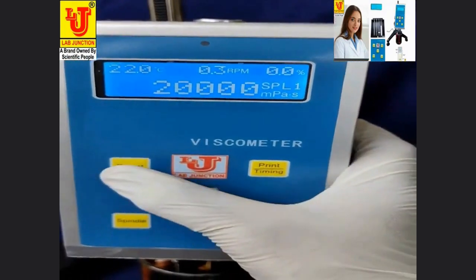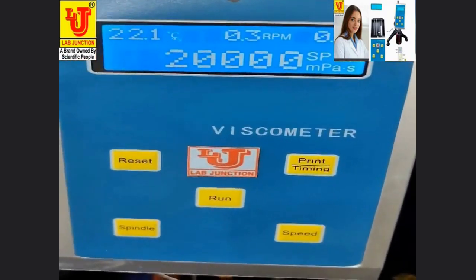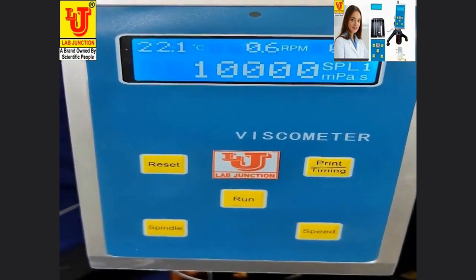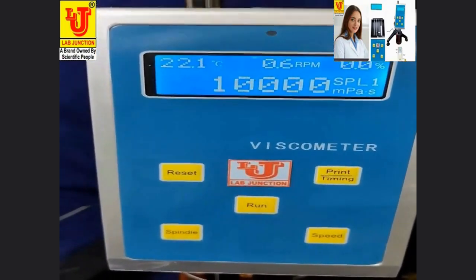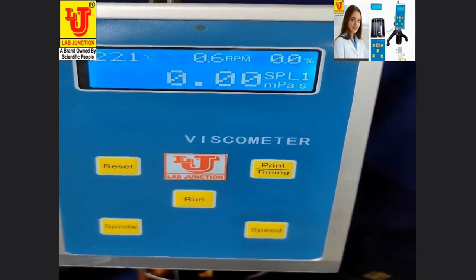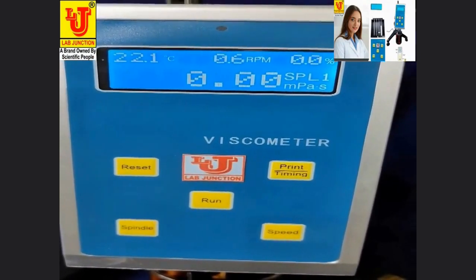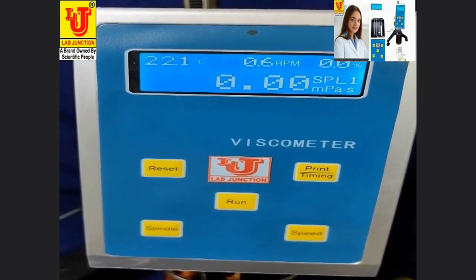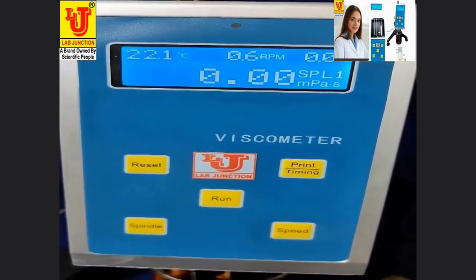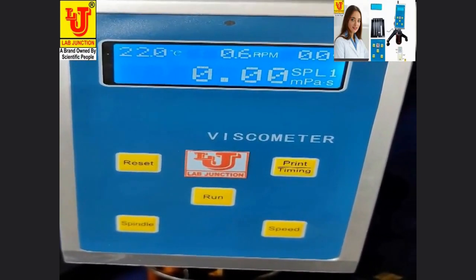Now again resetting the instrument and setting speed to 0.6 RPM and pressing run. At 0.6 RPM, my torque value is also 0.